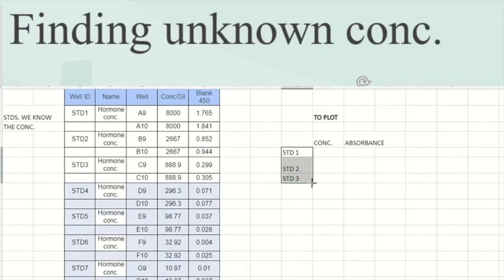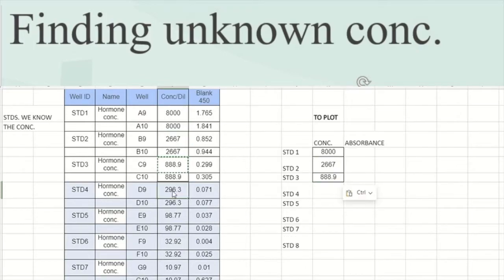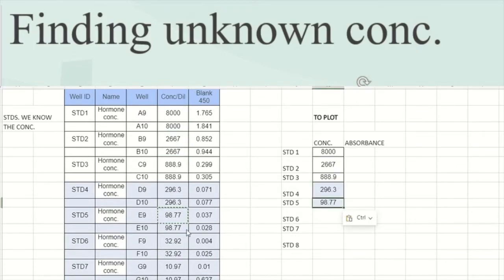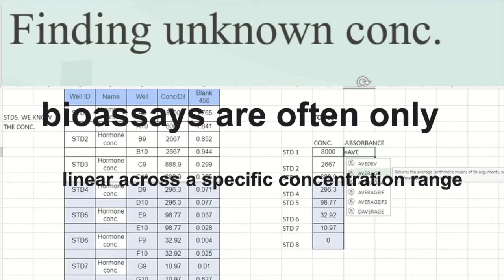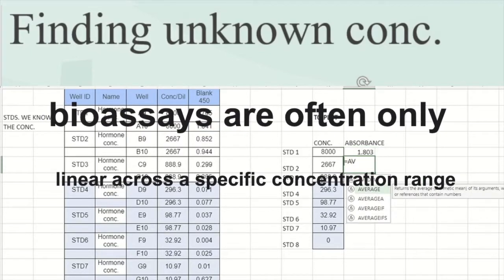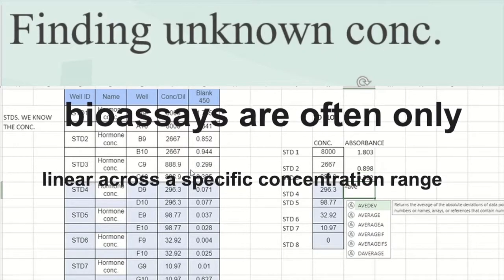I have a video on here on how to determine which line of best fit you should choose, but in this particular video, because it's an ELISA absorbance reading of particular concentrations, we could pick a linear regression, a linear line of best fit, or, if you're doing ELISA, it's recommended that you use a 4-parameter logistic fit.